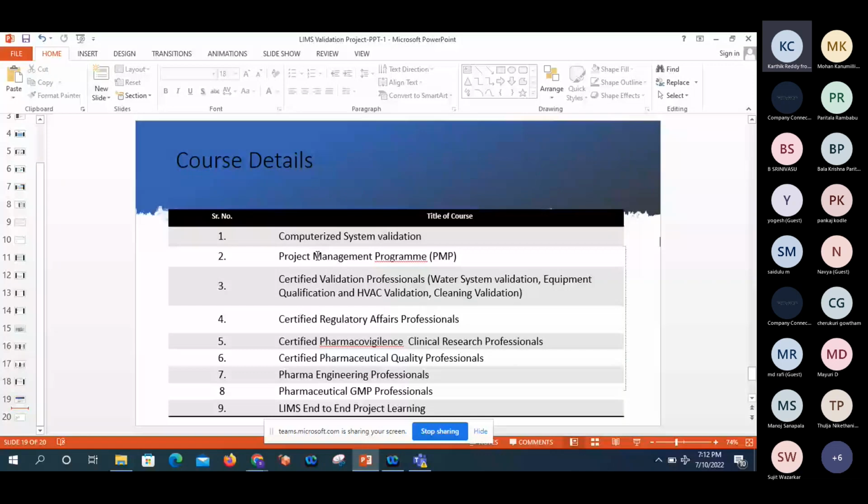See, for example, balance is one of the parsing scripts. There is a header part, how it would be. In the middle part, whatever is there. On the downside, there is a date and time. So these things I'll give just as a demo only. Each and every balance is different, there is Mettler Toledo, Sartorius, different balances are there, right? Models are also there, so the parsing script would be different.